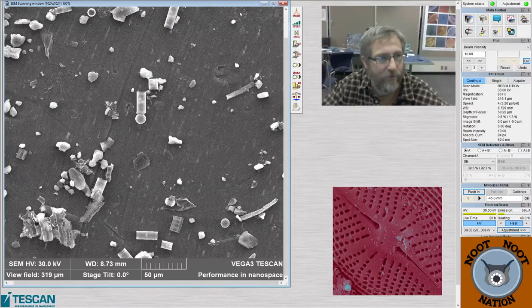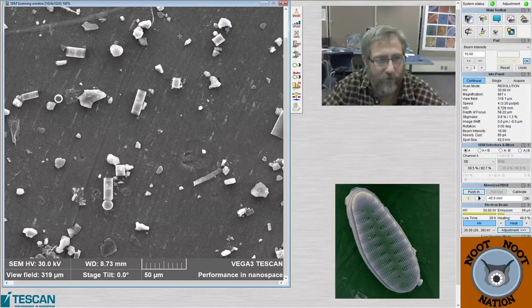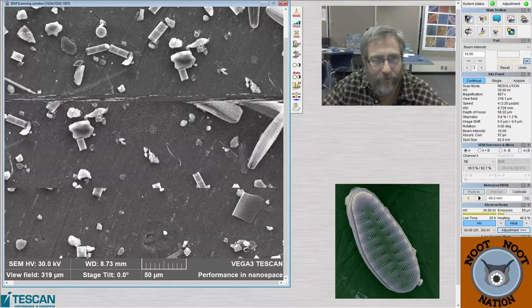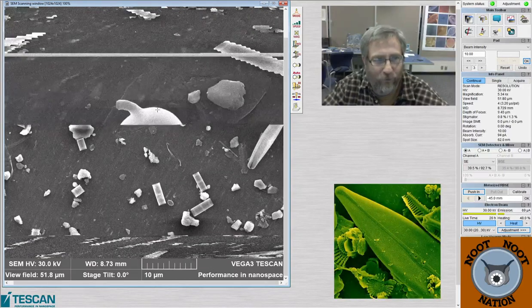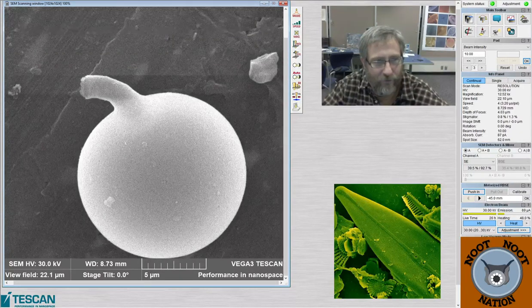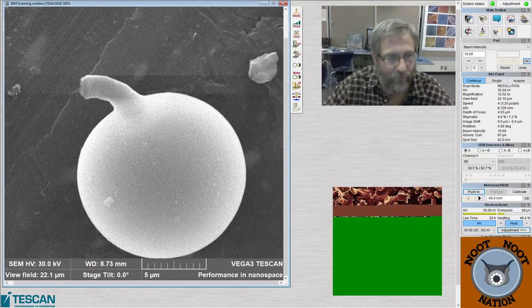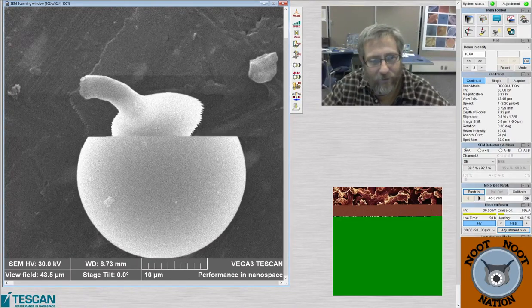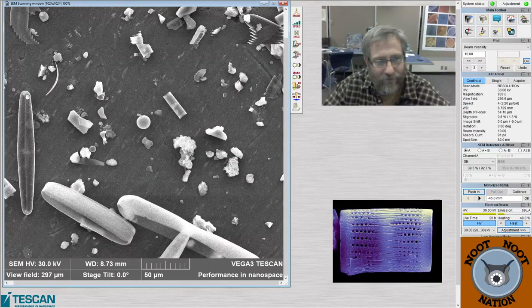That's a chrysophyte. Those are chrysophytes. They're all little, like Christmas tree ornaments, you know? Little round globe. Here's another one. Pretty easy to pick out in these samples. There's one. Oh, here's one with a little tube, like a weird little nosy tube sticking off of it. That's where the organism crawls in and out, and then I think it must seal it up for the winter time or something. But it looks like a balloon or something weird, right? A little bit of a tube sticking out where the hanger would normally be for our Christmas tree ornament.